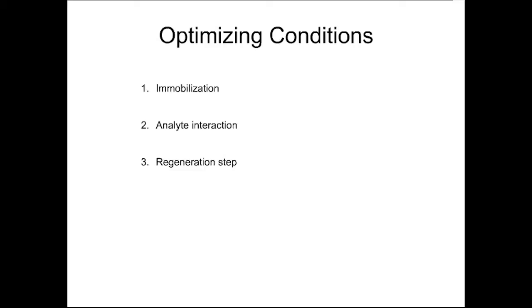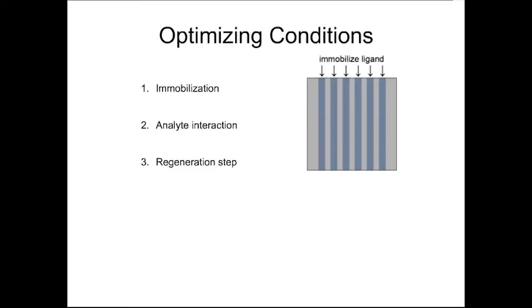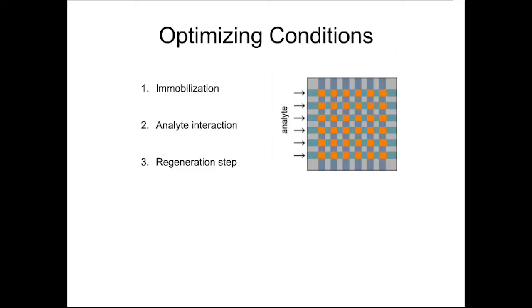The really nice thing about the ProteOn is the 6x6 grid design. So it makes this process go a little bit faster. So there are 6 lanes created vertically, and you generally immobilize your protein to the surface in this direction. And then there are 6 channels that are created horizontally where you're going to inject your analyte. So you essentially have 36 different spots on your chip, and if you wanted to, you could study up to 36 different ligand analyte combinations, or you could use this in a way to cycle through a variety of different conditions very quickly. And I found this to be really convenient.